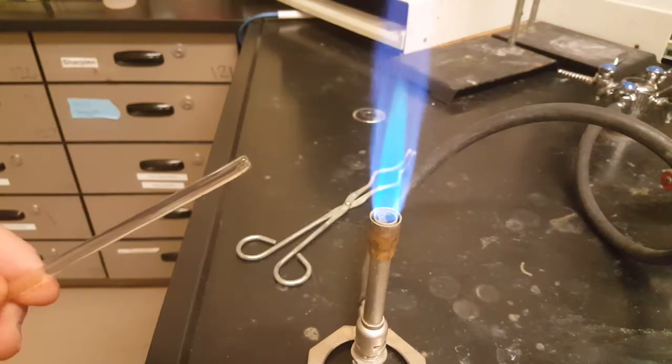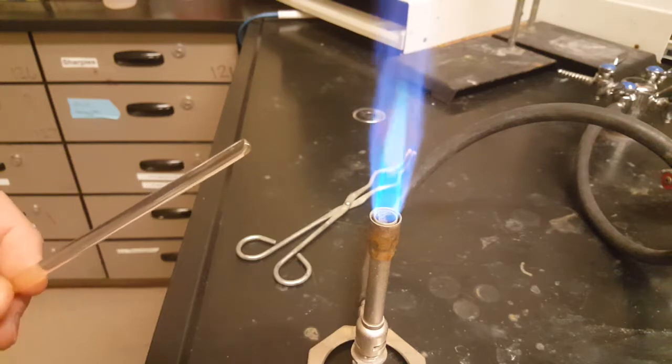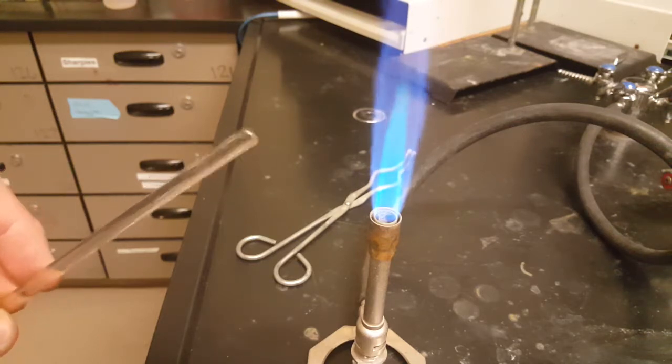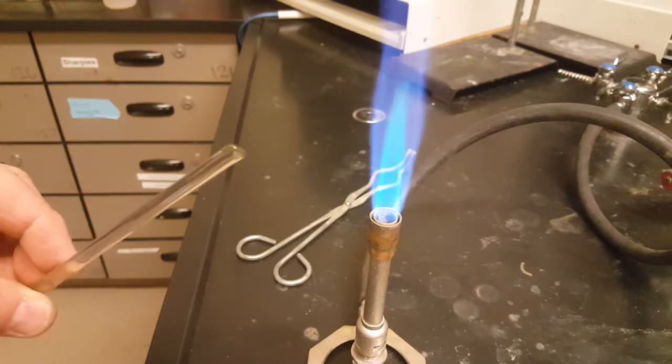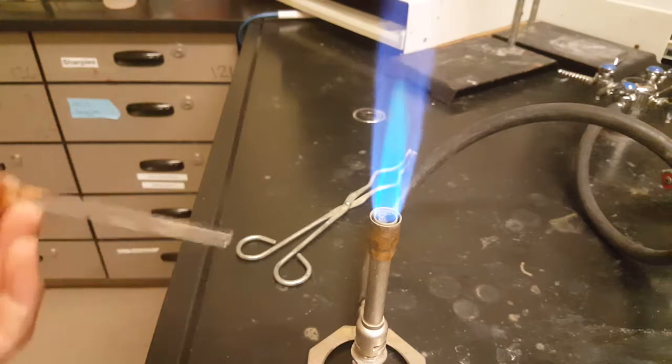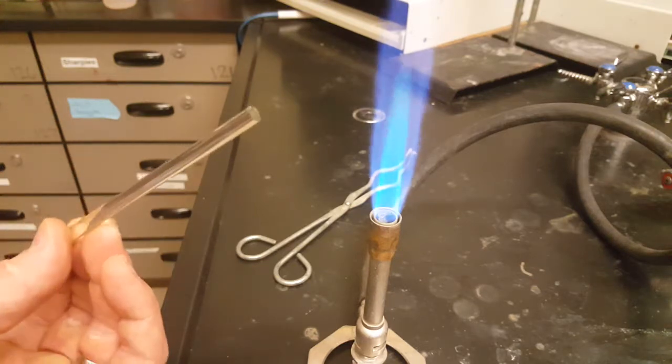After about two or three minutes of rolling the glass rod around in the Bunsen burner flame, the tip is really soft, and it'll cool down and be safe to touch. Then flip it over and do the other side as well.